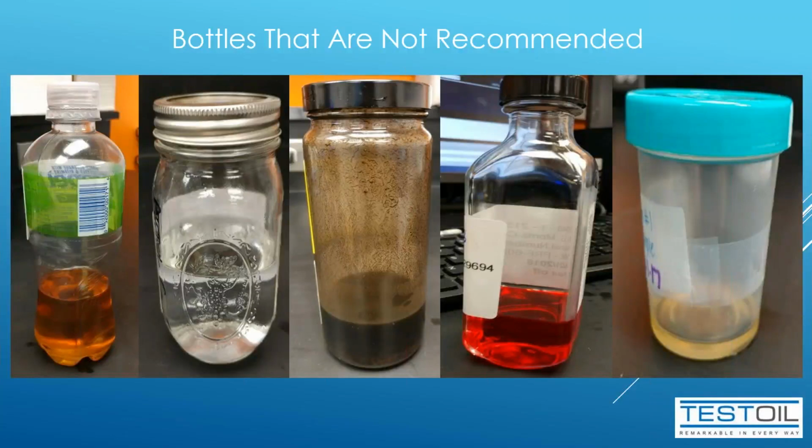Okay, and many of the samples that are sent in that are not in our designated bottles break or leak the oil before we even receive them. These are some examples of bottles that are not ideal to use. I mean, you wouldn't believe if I told you some of the things that have been used to send samples in. Just when I think I've seen everything, something new comes in. Just yesterday, we received some samples in vinegar bottles.